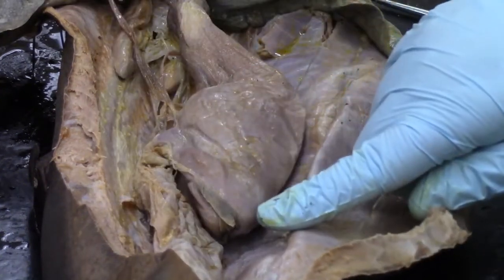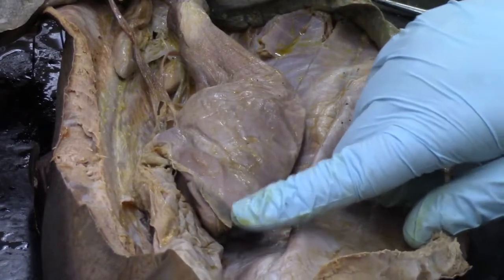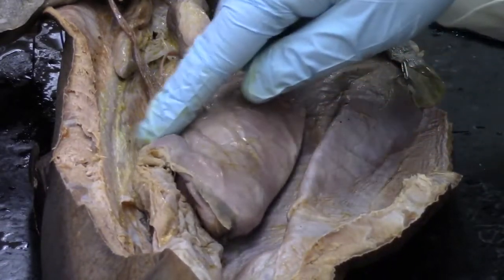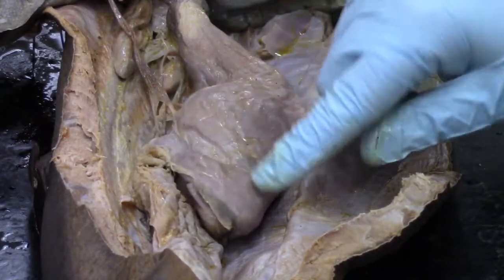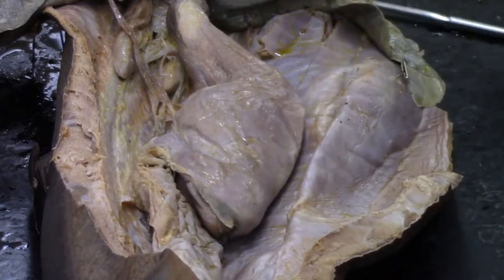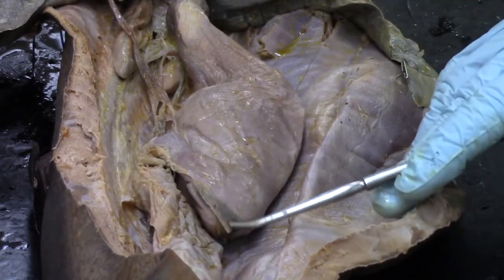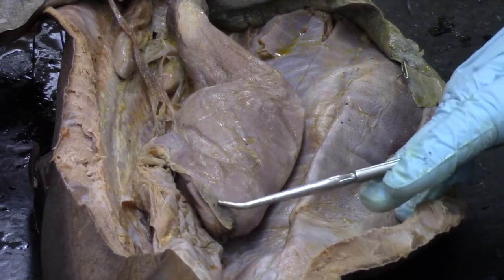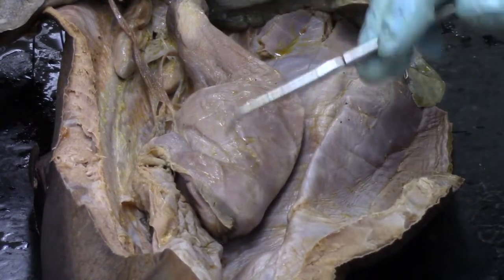Towards the posterior end of the stomach, we make a little turn here. Right before we make the turn, we're going to find another structure that looks fairly similar in color and texture to the liver. That will be our shark's spleen.